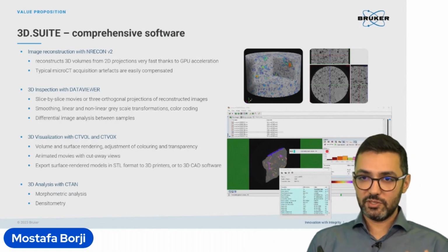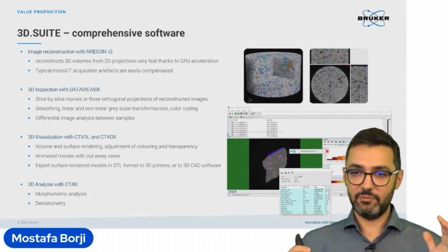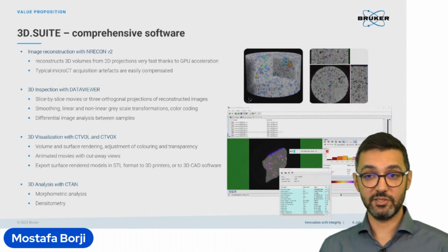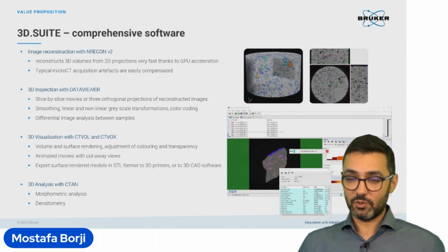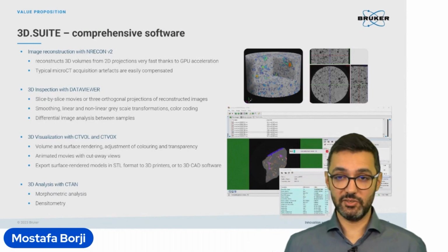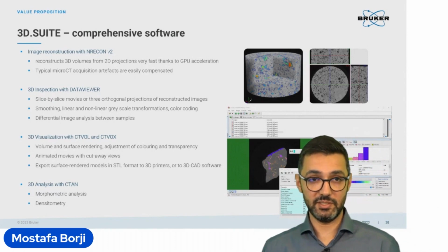So when we do the scans, when we acquire the 2D projections, the very first step that we need to do is to put them together and then reconstruct the data set. So our reconstruction software is GPU accelerated, and it reduces the reconstruction time significantly.